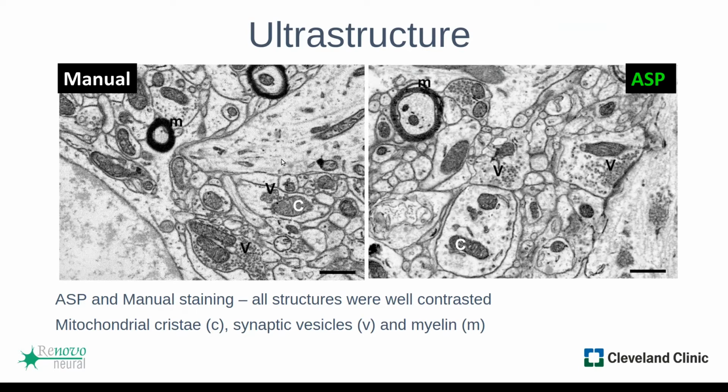We were able to resolve critical smaller ultrastructural features such as mitochondrial cristae, synaptic vesicles, and membranes looked nice, synapses looked nice, cellular membranes appeared well and intact, and cytoskeletal features also look uniform and haven't been disturbed post hoc during tissue handling. Also, we did not see any heavy metal precipitates that we have seen when people did inadequate rinsing or washing in manual staining methods.